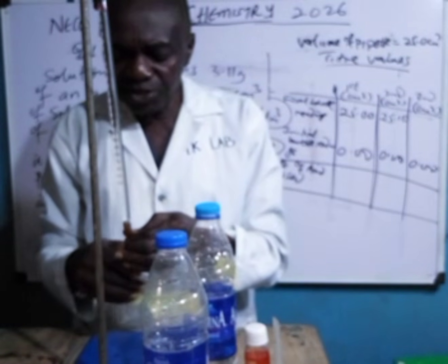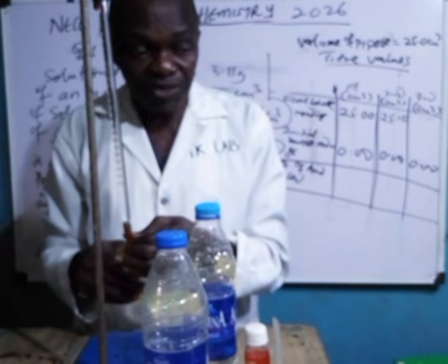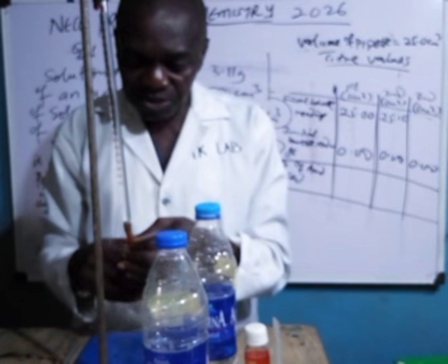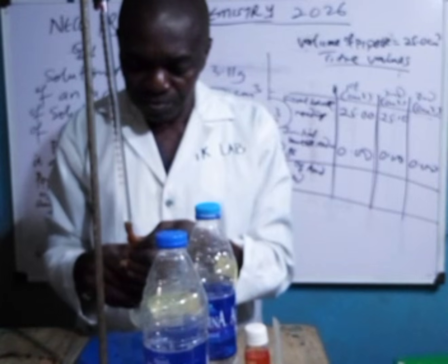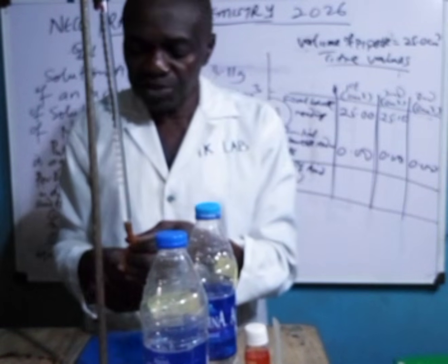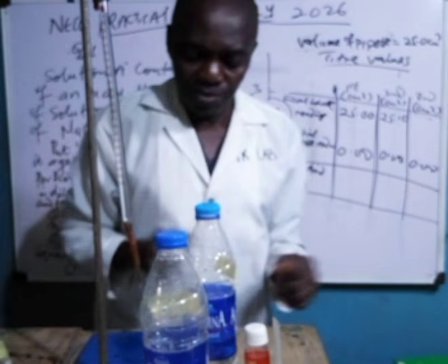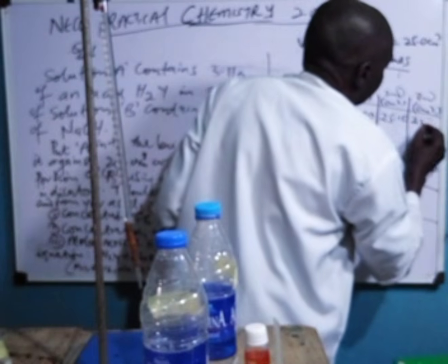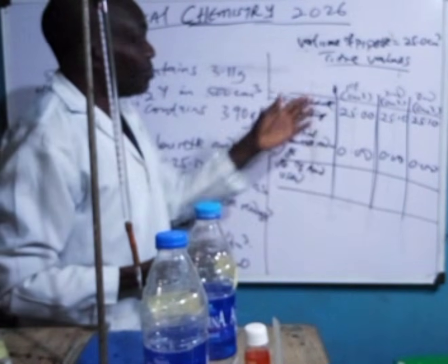We are doing the final titration. You don't need to do up to 5 or 6. Just do about 3. So just do 3 actually. It's gradually changing, so you start observing it. Let's see. 25.10. 25.10. So you can see we have got our titration values.